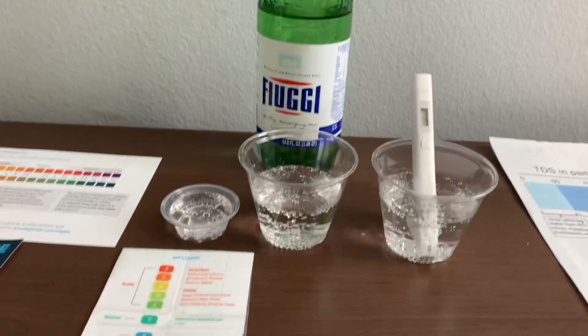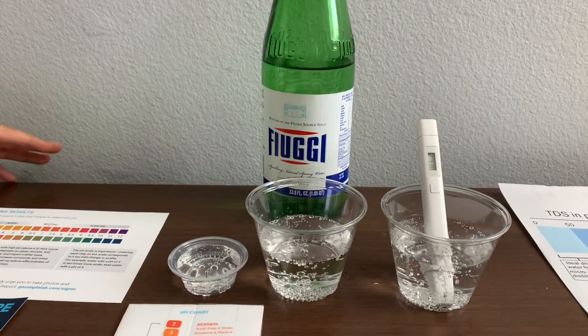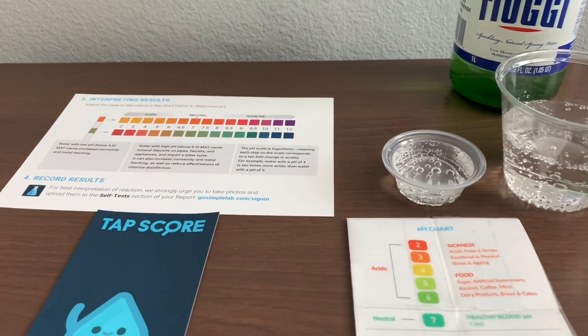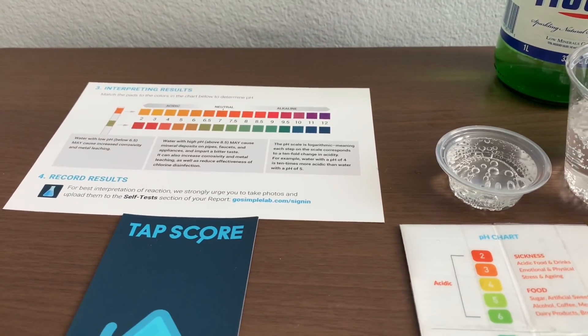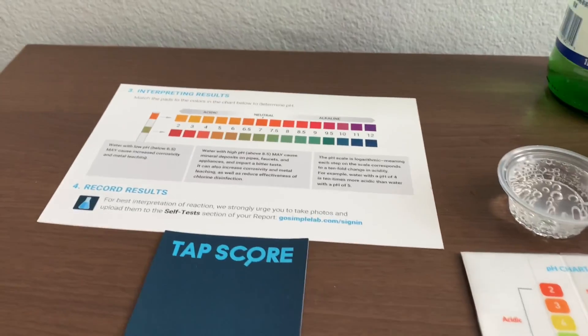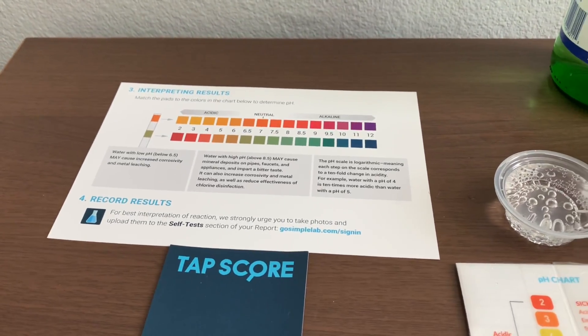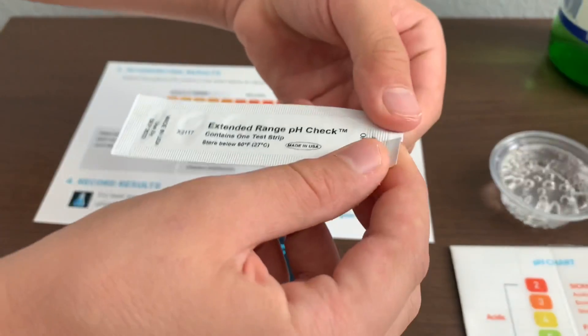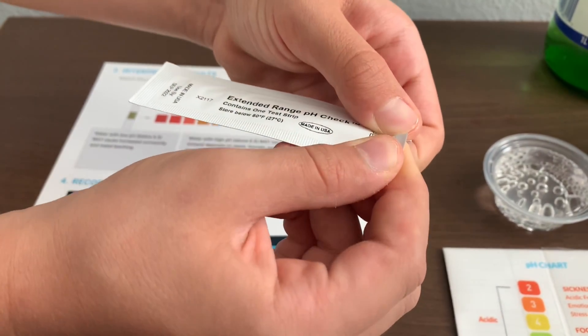Now let's test the pH level. We have two different pH testing things: drops and strips. The strips are from Simple Lab and the drops are from pH Perfect. First, we're going to use the drops. The strips are in this packet.